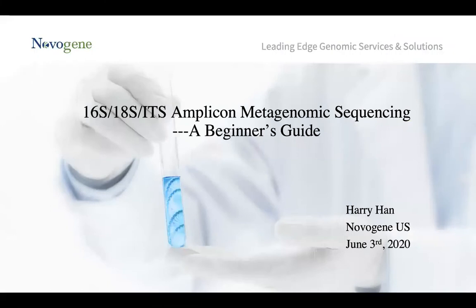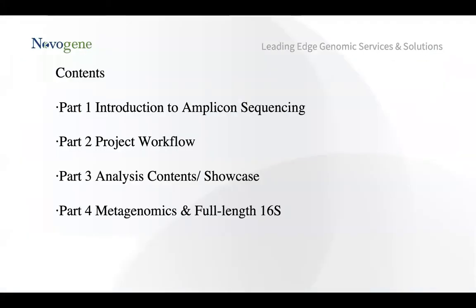A beginner's guide for 16S, 18S, and ITS Amplicon Metagenomic Sequencing. So I would like to break today's presentation into 4 parts. Firstly, a brief introduction of what amplicon sequencing is. Then the project workflow from DNA extraction to bioinformatic analysis. And after that, we will have a led discussion, or we could call it a comparison among NGS 16S amplicon sequencing, shotgun metagenomics, and full-length 16S amplicon sequencing by using the PacBio platform.